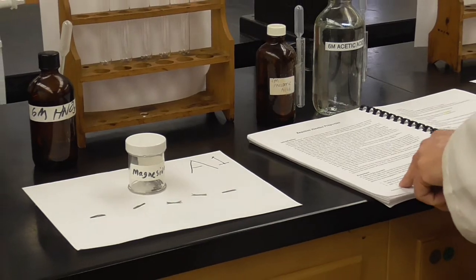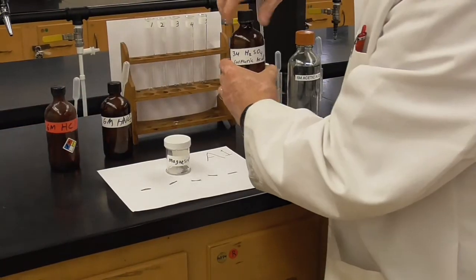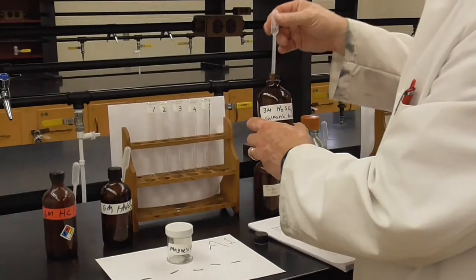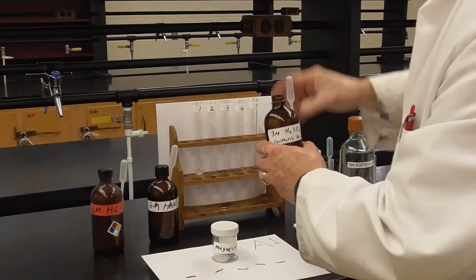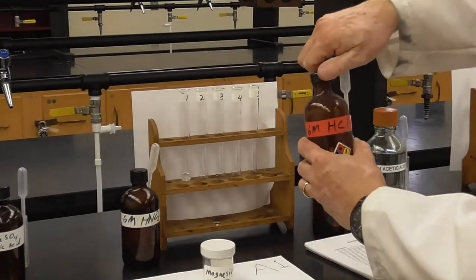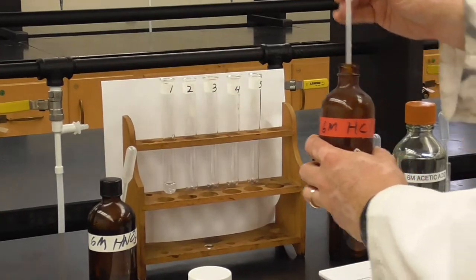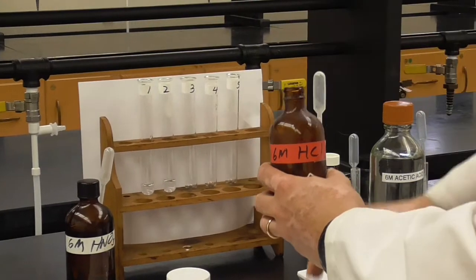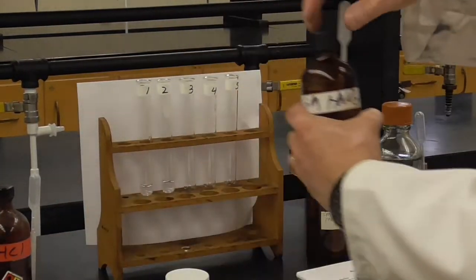So, all right, let's add 1 milliliter of each acid to each test tube. So let's just go right down the line. Sulfuric acid. This is approximately 1 milliliter down there. Number 2, hydrochloric acid. Number 3, nitric acid.